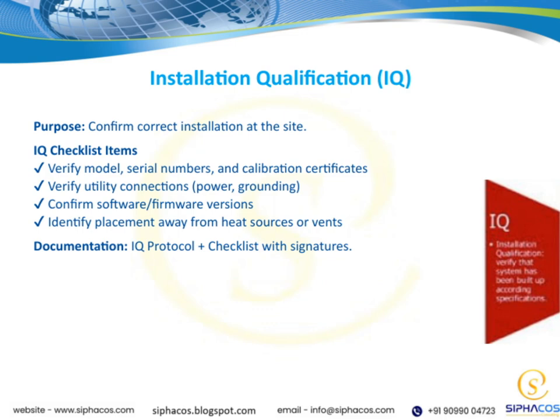All of these checks are documented thoroughly in the IQ protocol and checklist, and it's essential to gather signatures to verify that each step has been completed properly. By following these steps, we help ensure the equipment is installed correctly, which is fundamental for achieving reliable and accurate operation moving forward.